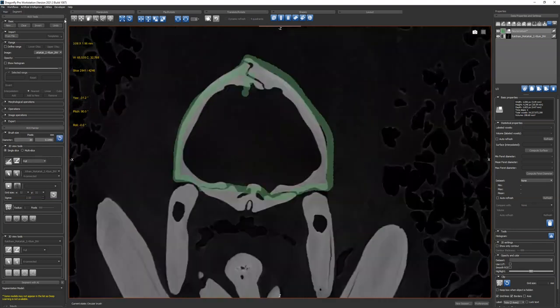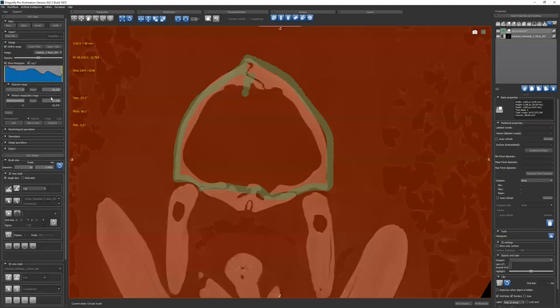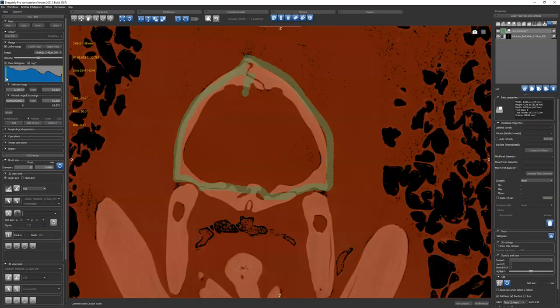So the very first thing you're going to do is tell the computer where I can paint and where I can't. So up here you have define range and show histogram if you want, it doesn't matter. Everything that turned red is what you can now paint. I should have mentioned, on the left is your low density values and the right is your high density values.